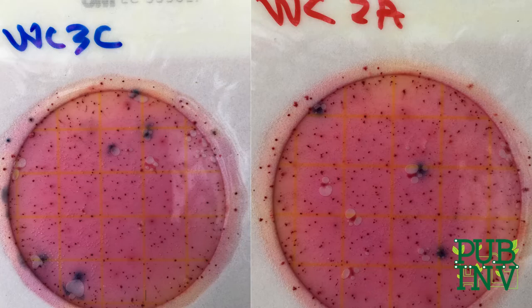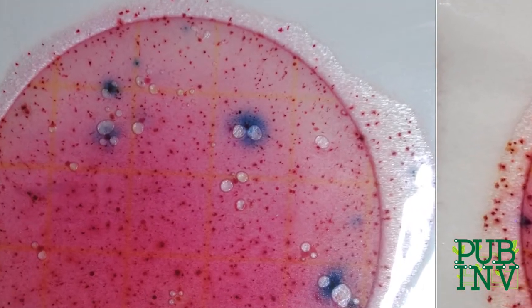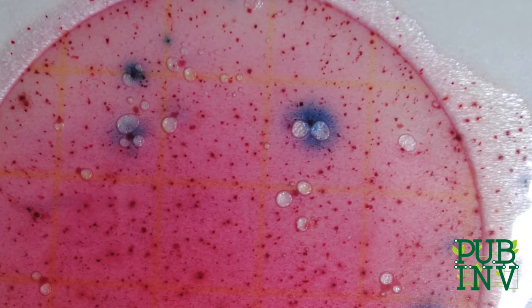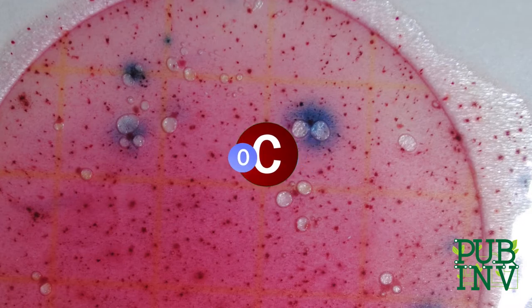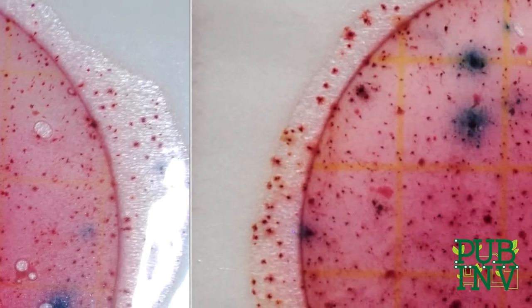Make sure you take a picture at the 24-hour mark and then at 48 hours to see if there are any blue spots. Blue spots with little bubbles under the film indicate the presence of E. coli. E. coli produces CO2 as it eats and grows. CO2 is a gas that will be trapped under the film. A blue dot without a bubble will be some kind of bacteria that's not E. coli.